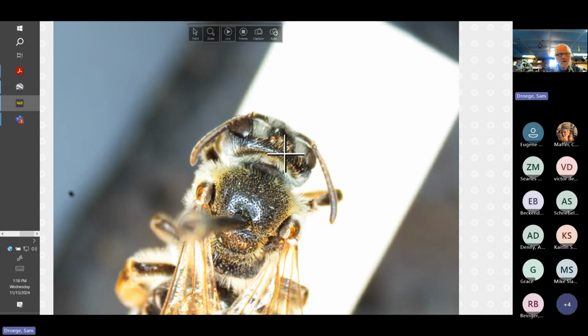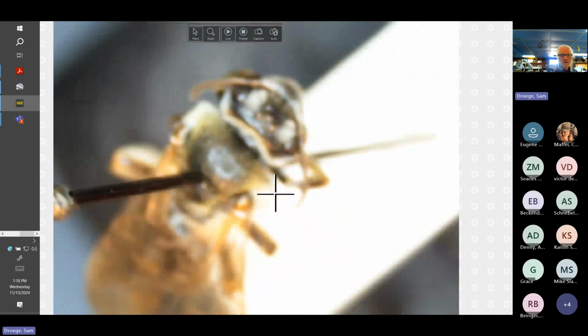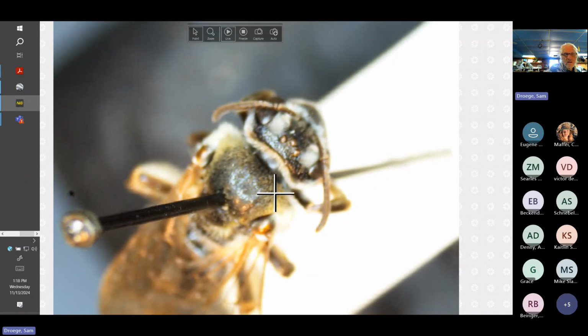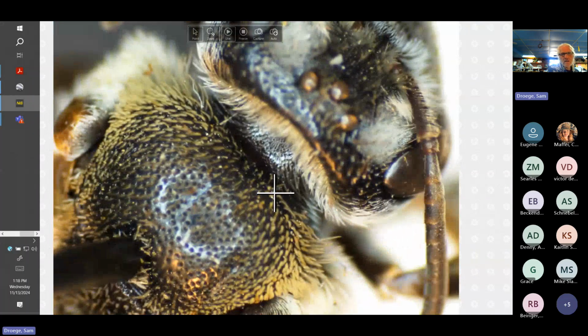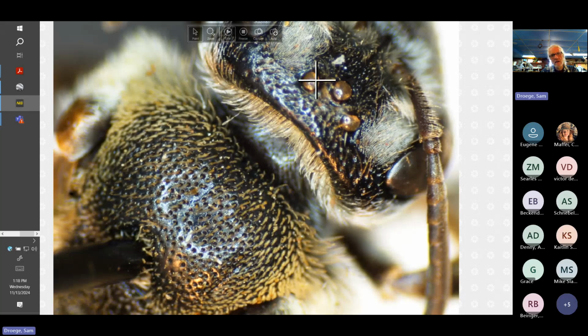And then there was a comment that the vertex is fairly tall. Yes, but I think you have that covered in here by the marking on the Excel spreadsheet. Yeah, so we can see usually things are measured here in diameters of ocelli.